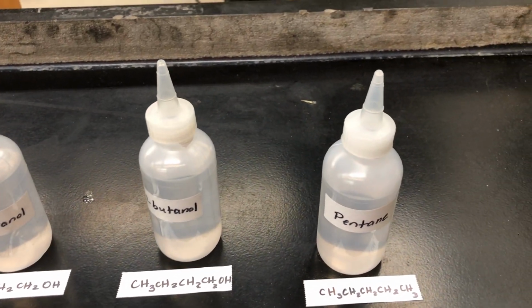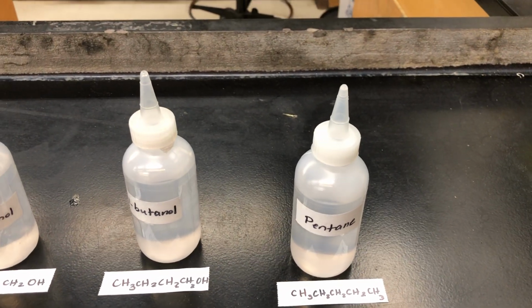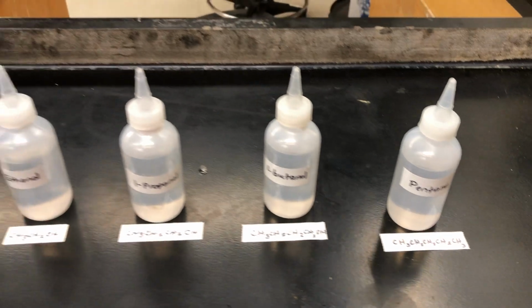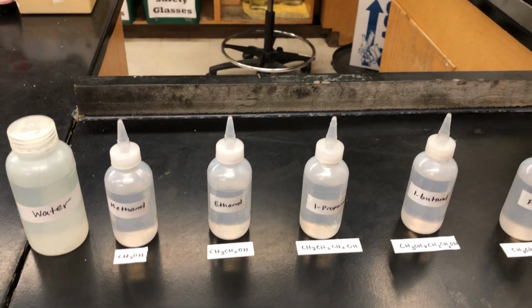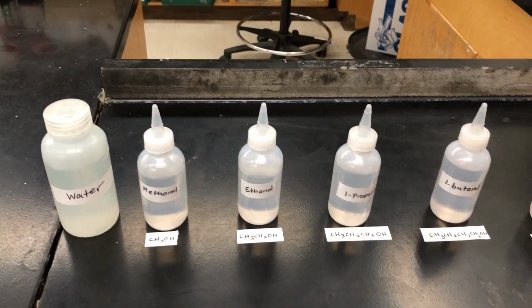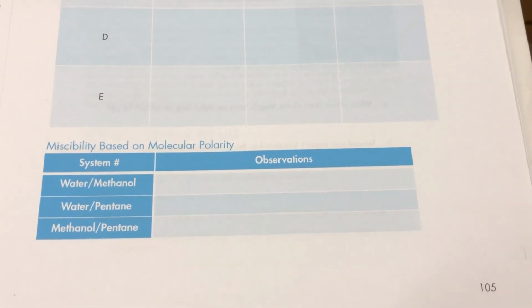And we're also going to be looking at pentane, which is a very common hydrocarbon. It's a non-polar molecule. And one way to express what we are going to study in lay terms is the principle of like dissolves like. Some people refer to that as oil and water don't mix, because of course water and oil are very different.